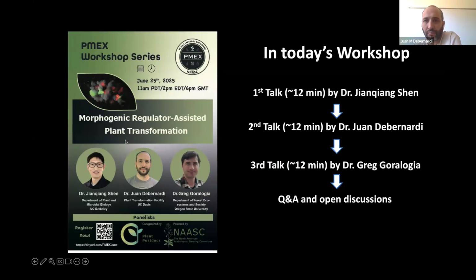One of the related questions is, what would be the most effective combination of tools developed to determine the morphogen that will function effectively to transform tree species? I think I just have to give an answer that's very similar to Juan's, in that you have to try multiple ones. You have to work on the in vitro protocol.